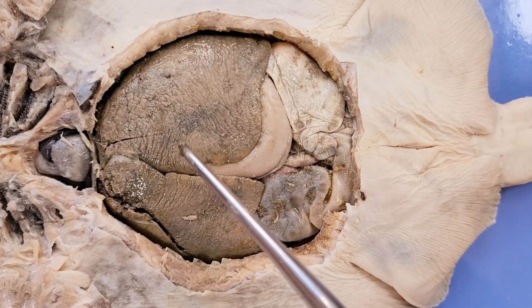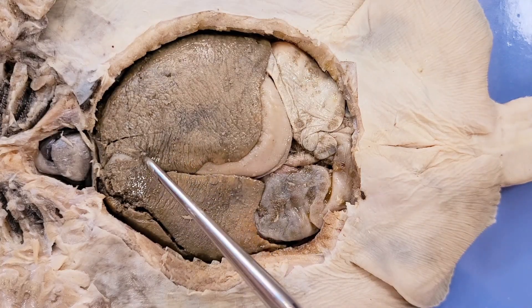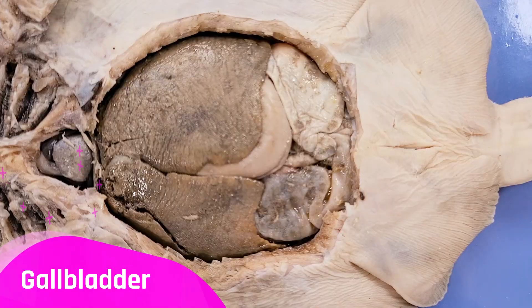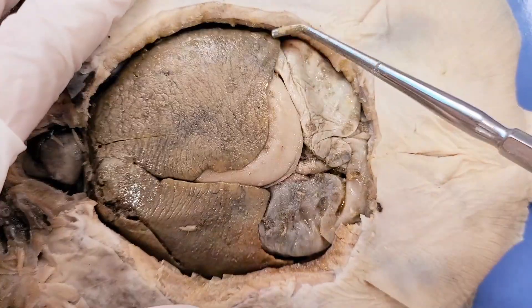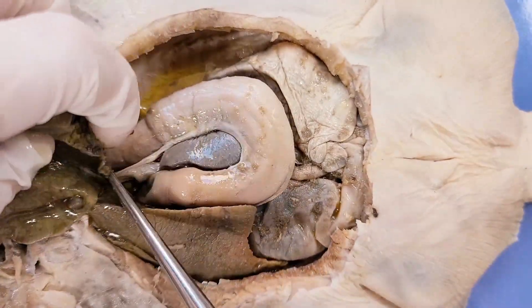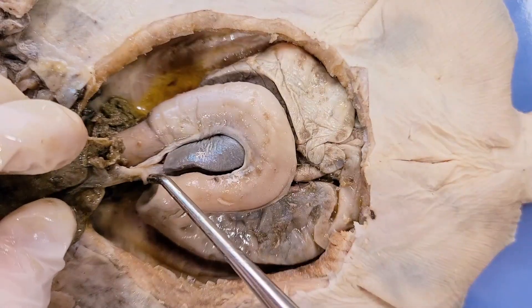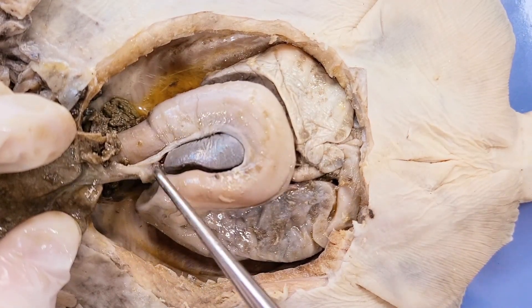The liver also produces bile, which is used to digest lipids in the skate's diet. The bile is then stored in this pouch-like structure here, which is called the gallbladder. Now we'll remove the liver to get a better look at the other organs. You can see here how the gallbladder leads into the small intestine, where it releases its bile.